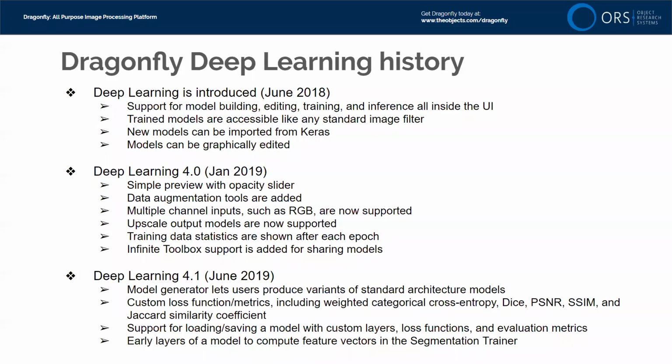The bottleneck for almost all of these experiments is not the computational time of training the model. It's very often the time in preparing the ground truth. And so if you have a data set that's difficult to segment by hand, that's the whole point of doing this. You don't want to segment 1,000 slices by hand. And so I tell you, well, you need to segment 5 slices by hand in order to have a training model. Well, now with data augmentation tools, maybe you can get by with just segmenting 1 slice by hand and then using data augmentation to fake it or augment that 1 slice with supplemental slices.